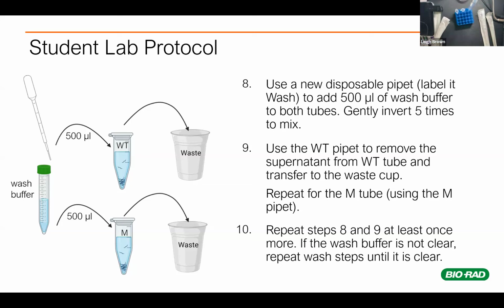This is usually 3 times, like 90% of the time I've run this lab. I've only had a handful of times where I don't know what happened, my E. coli culture just went crazy, and it took me 4 washes in order to get them clean. But most of the time, by the 3rd one, you're going to be super clean, and you'll be able to move on to the next step. So I'll let the timer go down for another minute here while your worms make their way down to the bottom of the tubes.